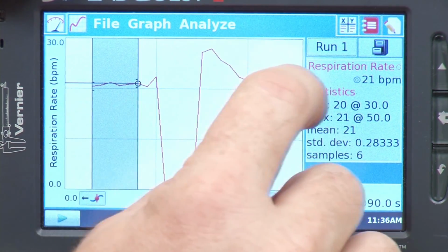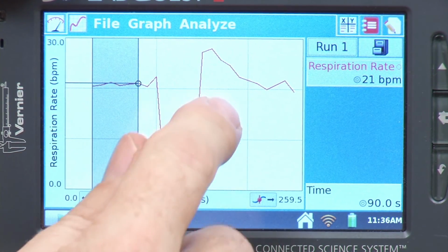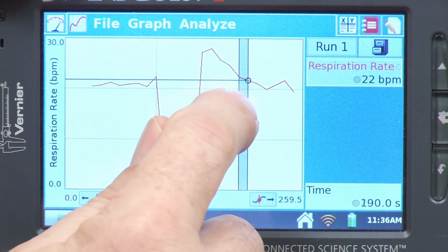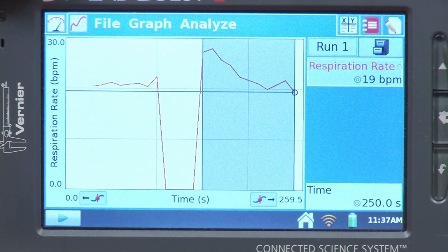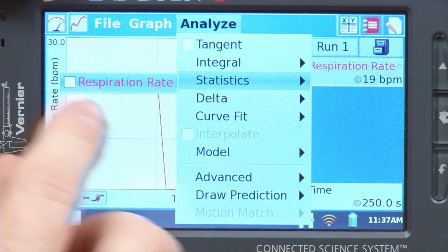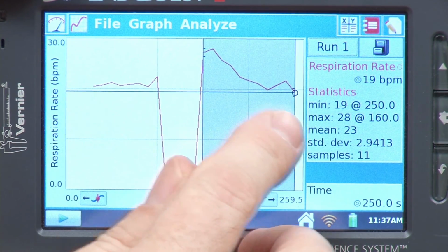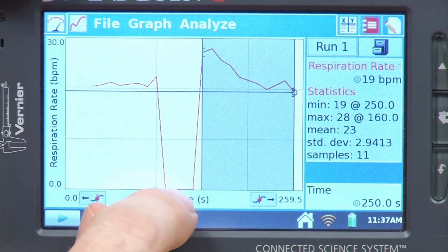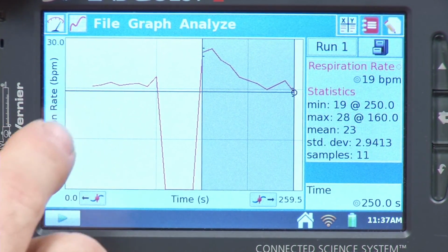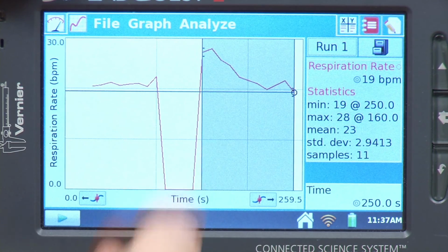If I wanted to do this other section here and maybe actually look at the change in values, I could do this. I'll go back to Stats, uncheck that. I'll go over here and maybe tap and drag. We start over here and go down this way. So I might be interested in what are the values in here with the stats, and go here and do the stats there. So actually, if you look there, we ended up with a maximum of 28 breaths per minute there at the top, and then it drops back down to about 19, about the same level I had over here. I won't do the stats down there because it drops down to 0 pretty obviously there. So obviously as I held my breath, then when my body had to recover, I started breathing faster, and then gradually it recovered back down to the normal breaths per minute.